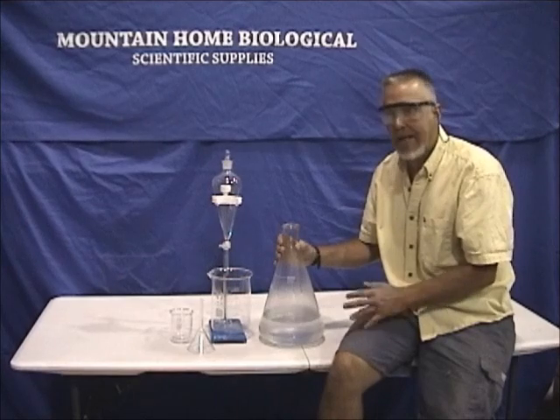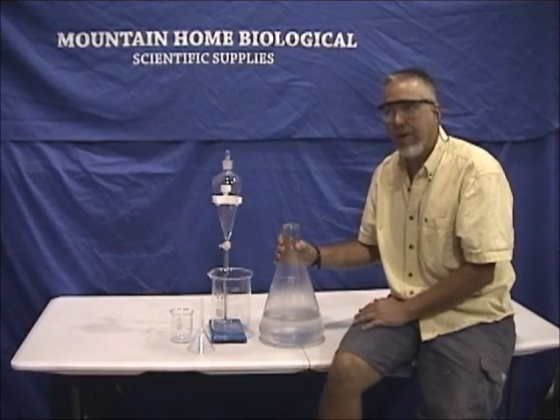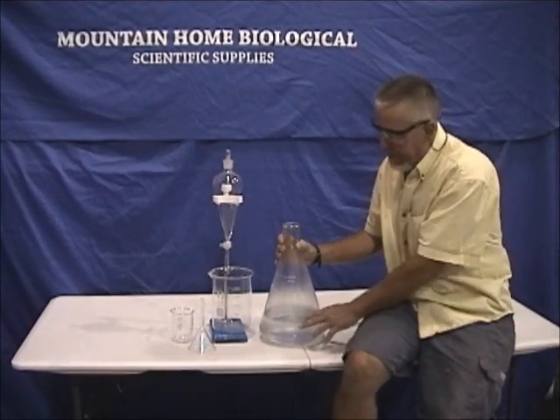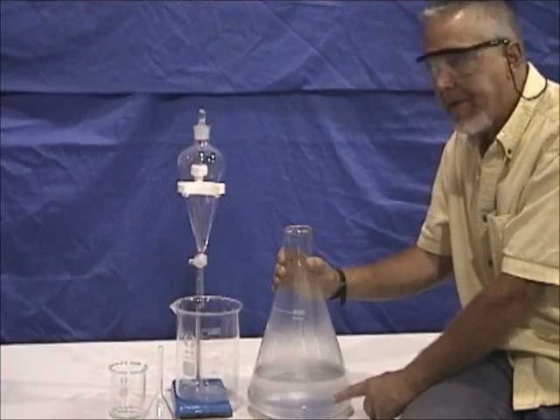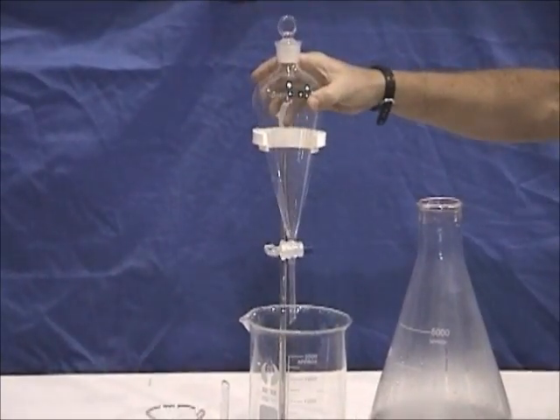We distilled the lavender for about an hour to an hour and a half — we feel that's the maximum time you need. You might get a little bit more oil if you go longer, but the majority of the oil is removed in the first hour to hour and a half. This is what we ended up with — there's oil and what's called hydrosol in here.